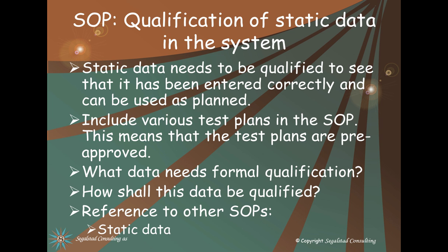So it is possible to include the various test plans inside the SOPs, maybe as an appendix or something. This means that the test plans are pre-approved. That could be useful. We also need the SOP to explain what data needs formal qualification and how it shall be qualified.